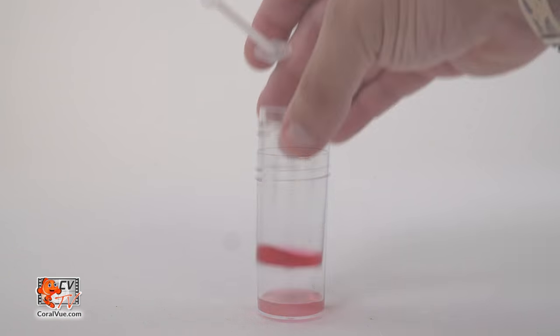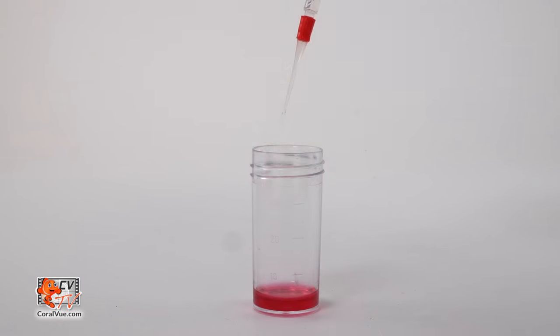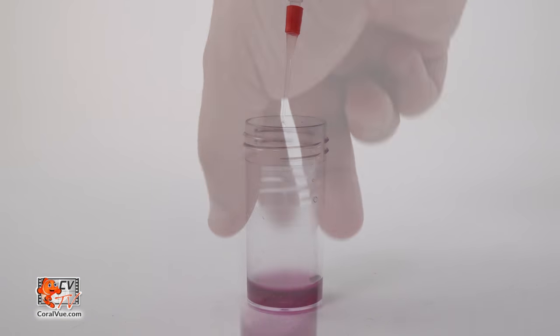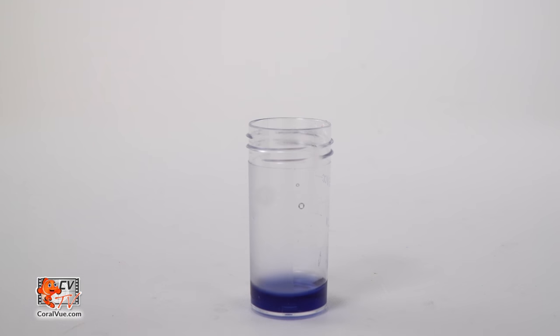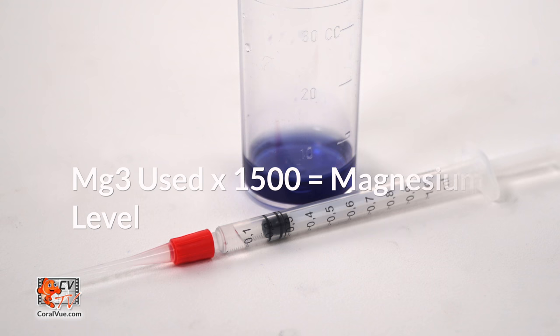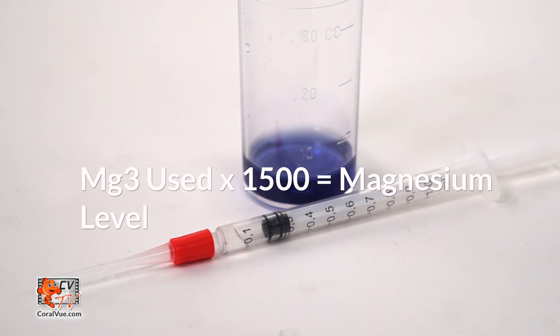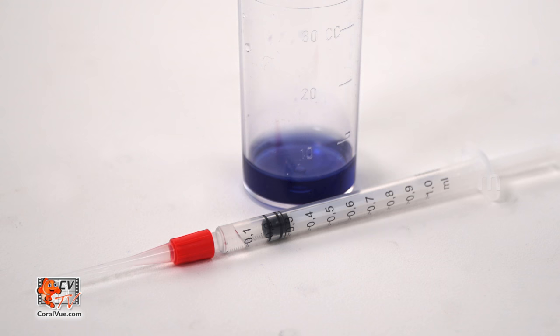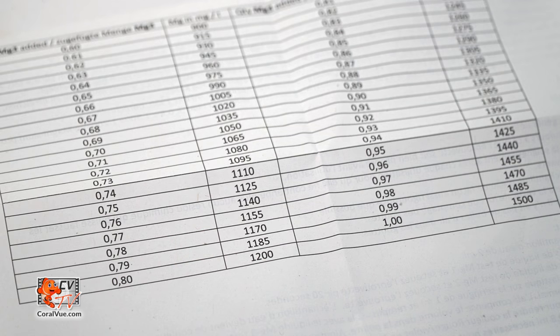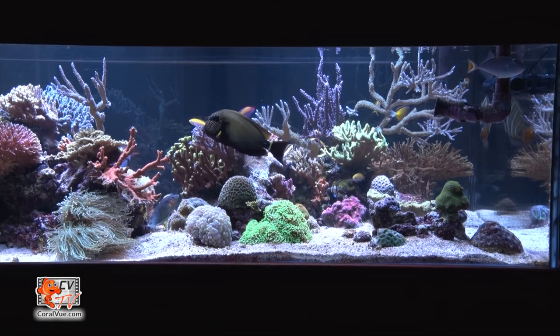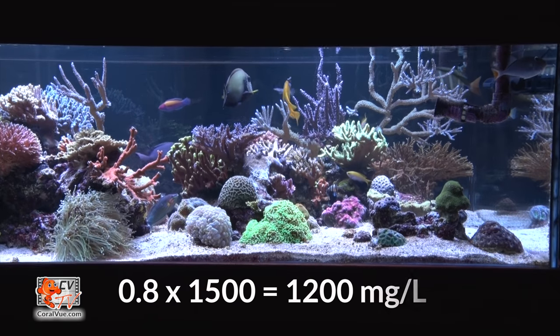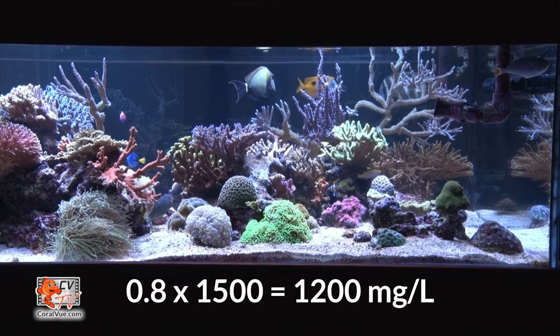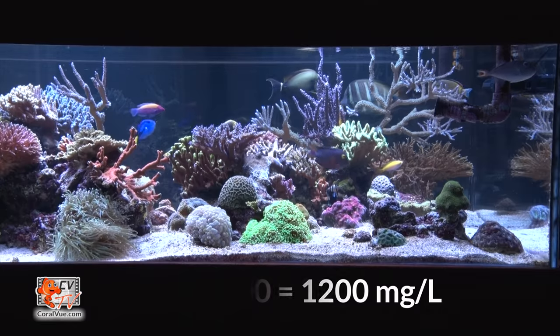Slowly add the syringe reagent one drop at a time and swirl the sample after each drop. Continue adding until the sample changes from a red purple to blue. Multiply the amount of MG3 used by 1500 to obtain the tank's magnesium levels, or you can simply use the chart included in the box. In our example, we used 0.8 milliliters of MG3 reagent, so final magnesium reading is 1200 milligrams per liter.